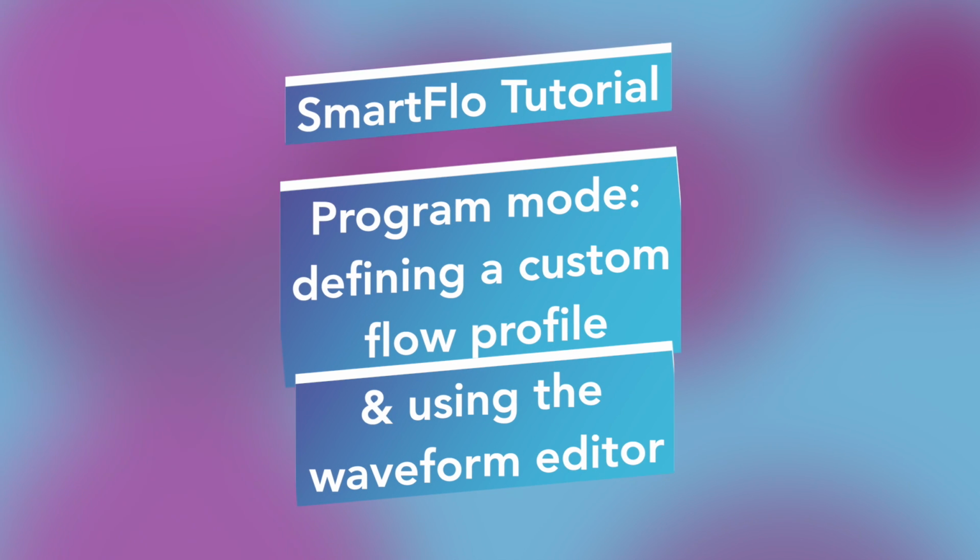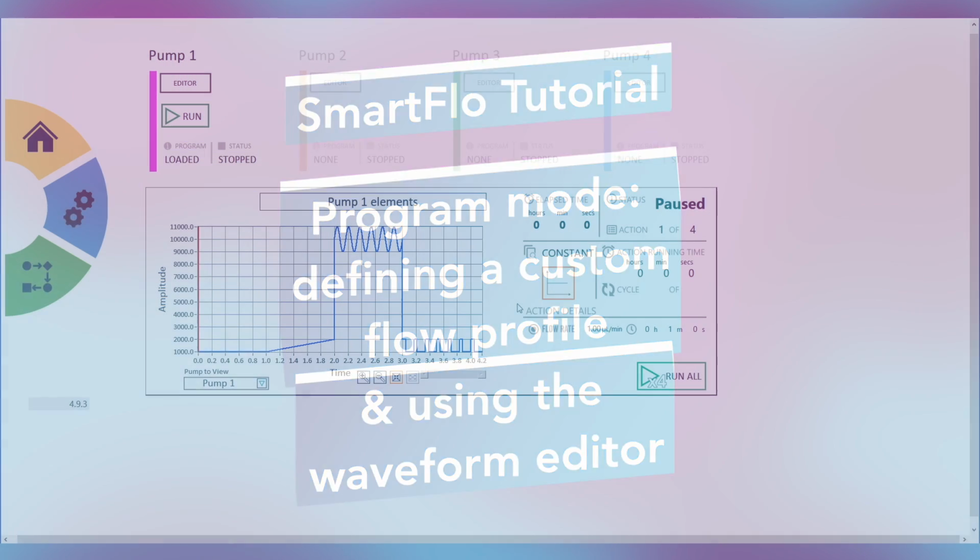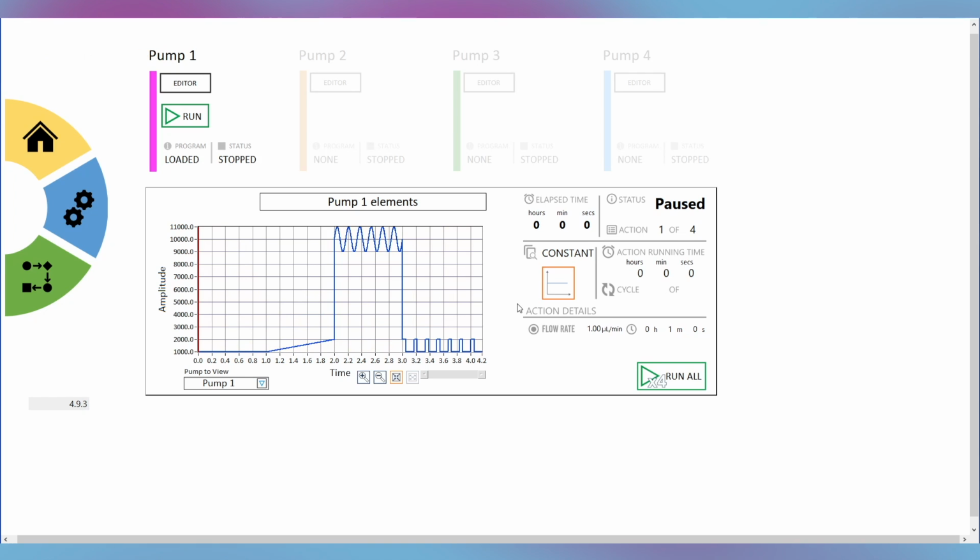In this video we'll be looking at program mode, defining a custom flow profile and using the Waveform editor. This is used to program a pump with a custom flow profile in order to have precise control of the flow rates and duration of a certain experiment.